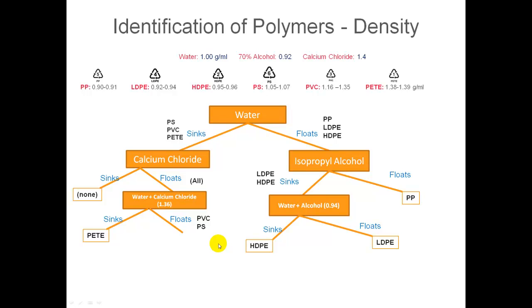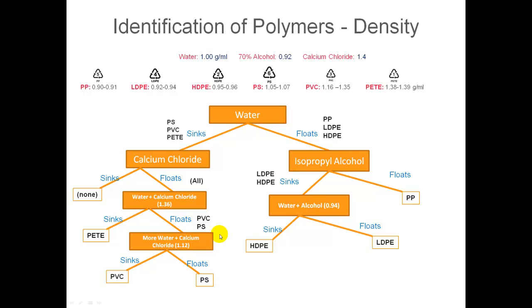We then continue adding more water to the calcium chloride solution until we get around 1.12. Since PVC has a higher density than polystyrene, PVC is going to sink first. The one that remains floating is polystyrene, which is the last to sink. So the one that sinks first is PVC, and the one that remains floating is polystyrene. Now we've isolated all three polymers on this side, and that's how it's done.